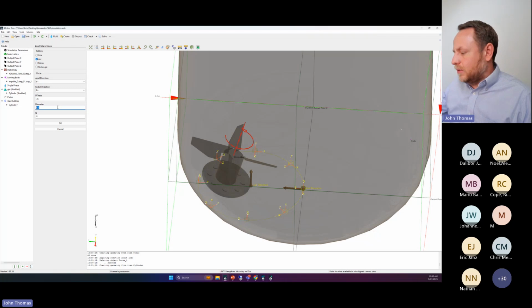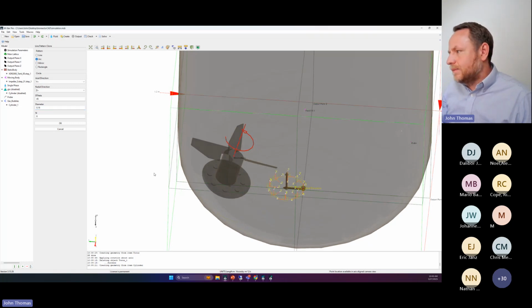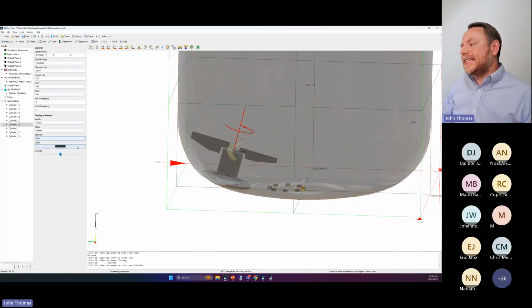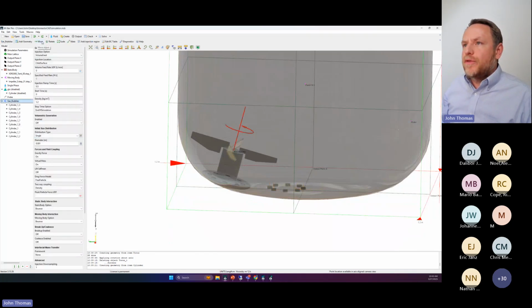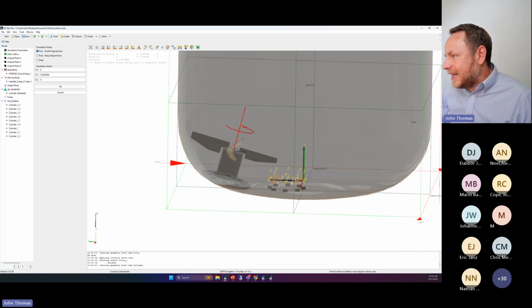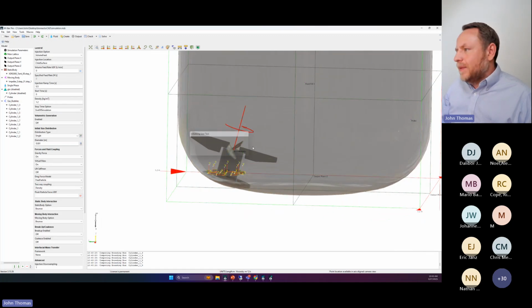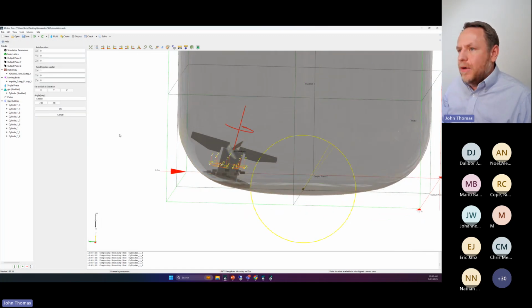And this diameter here was like 0.16, if I recall. If I can adjust that for the fact. Okay, good enough. So I'll just add those guys in. And now I'm doing the sophisticated man sparge. And I'll move this guy up. And for those who are really interested in getting this right, which I'm interested in getting right too, you can do this in CAD after the fact. I'm just showing how to do it in M-Star now.